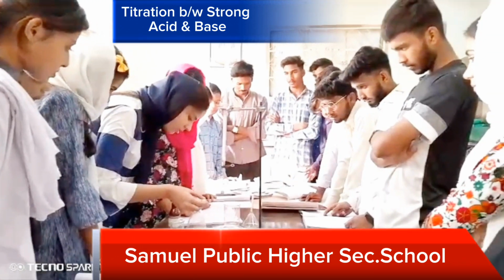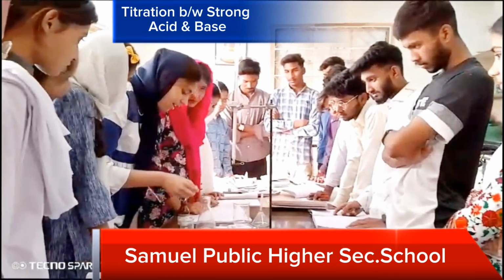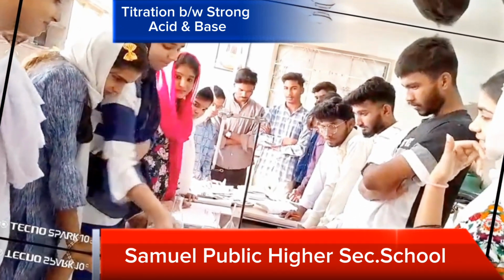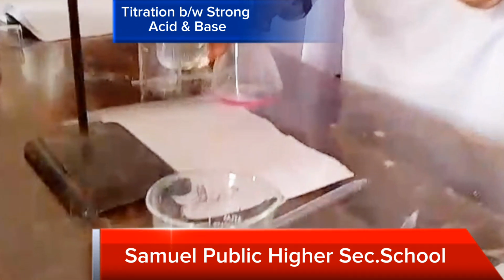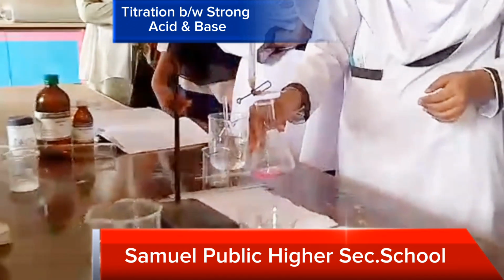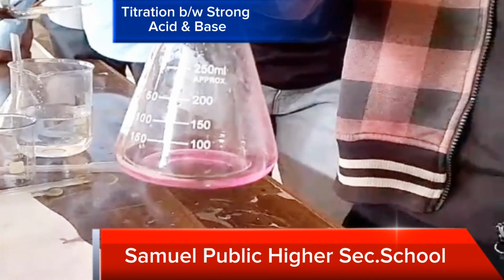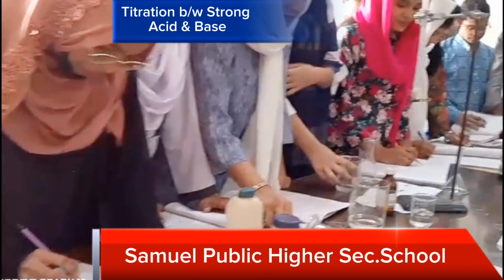At the time when we see the light pink color in the conical flask, we can determine that salt and water are produced by the combination of the sodium hydroxide and hydrochloric acid. So the burette final reading is noted in your observation column.